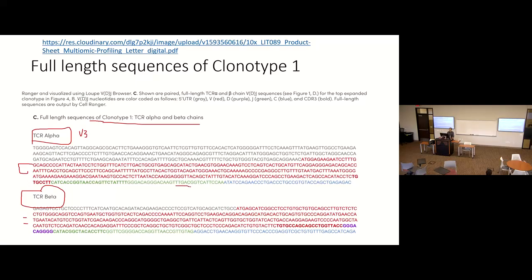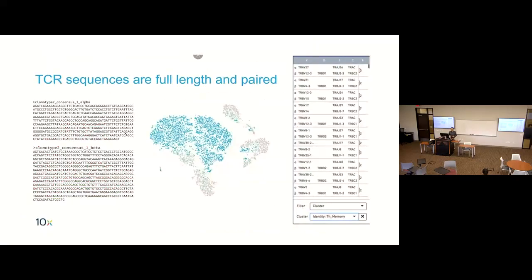This region could be J27, something like this. So you have the full sequence information for that particular receptor region, and it tells you this T cell is amplified, this particular type of T cell receptor on the surface.